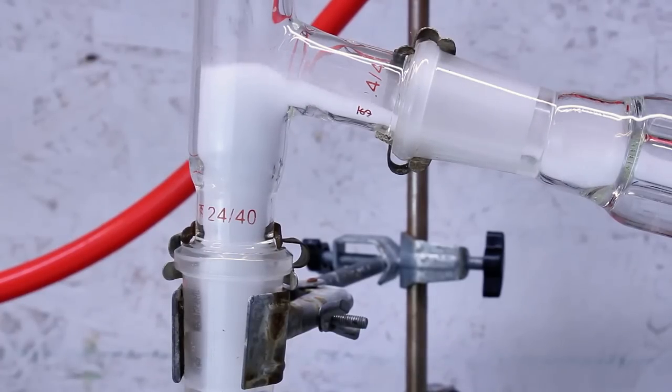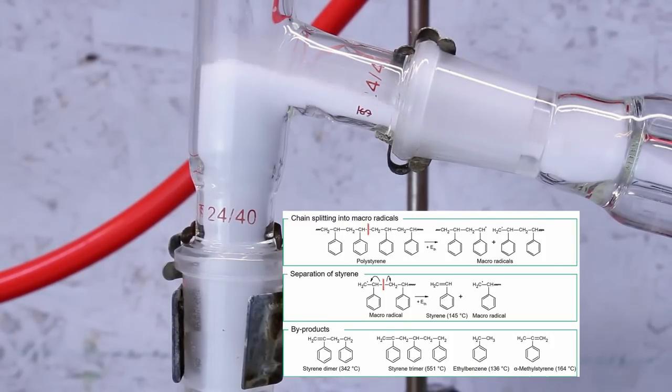What's happening here is that when polystyrene is heated to a sufficient temperature, it begins to break down into its monomer, styrene, as well as a few other side products.